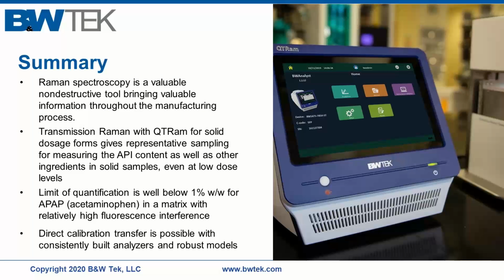So I hope that I've been able to show you that Raman spectroscopy is a valuable and non-destructive tool that can bring important information throughout pharmaceutical manufacturing processes, and specifically to content uniformity testing.